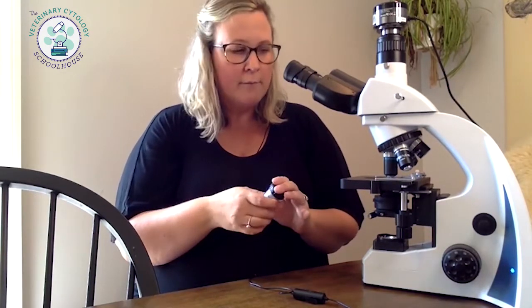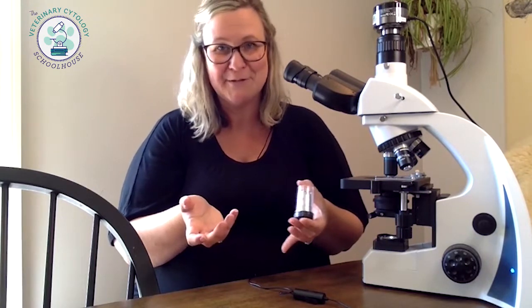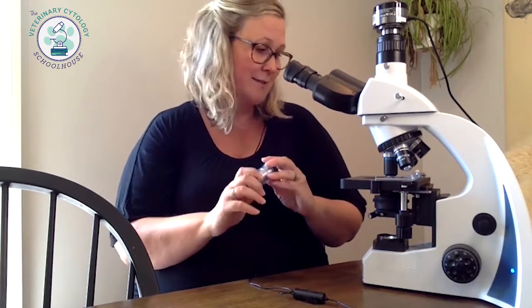I love having a 50x oil objective because it sits between the 40x and 100x — it's an oil objective so you get a nice crisp clear image. With cytology you really want to be able to make out cell patterns and how they're interacting with each other, and sometimes when you're straight on the 100x it can be hard to get a feel for that pattern. Being able to back out to 50x and have that oil clarity is really nice. It's not for everybody, but it's a nice objective to have — maybe ask for it for the holidays.